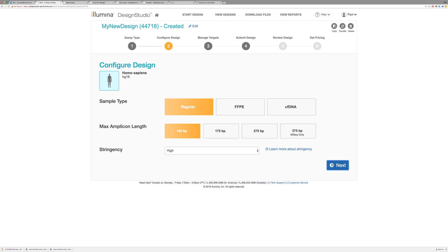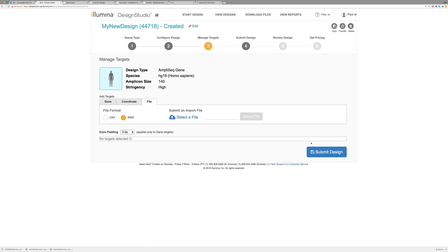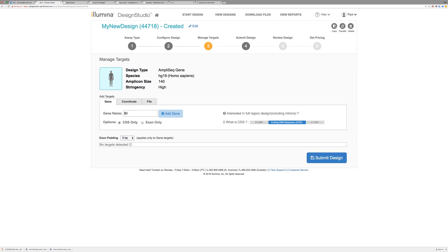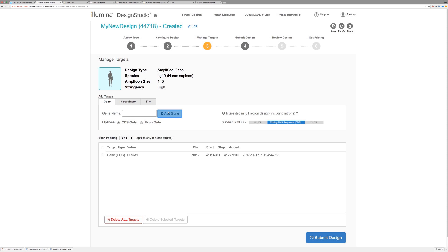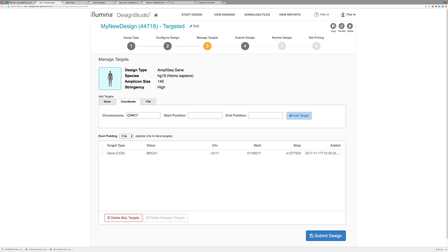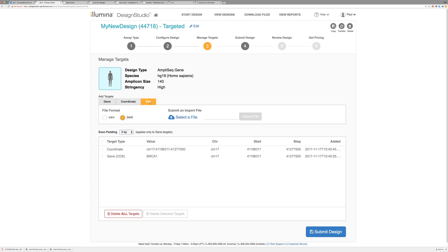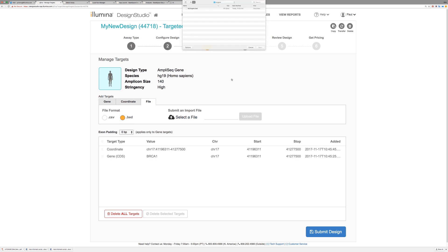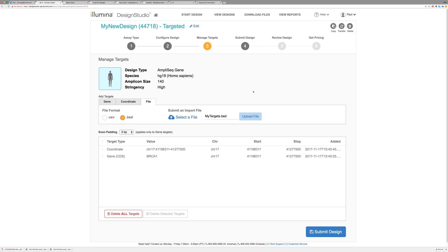Next, you'll add your targets. You can do this in three different ways. The first option is to enter the gene names of interest — gene names that match what you type in the search box will appear. The second option is to enter the coordinates of interest. The third option is adding a file that contains gene names and/or coordinates. Save either as a CSV or BED file, then browse and upload it.